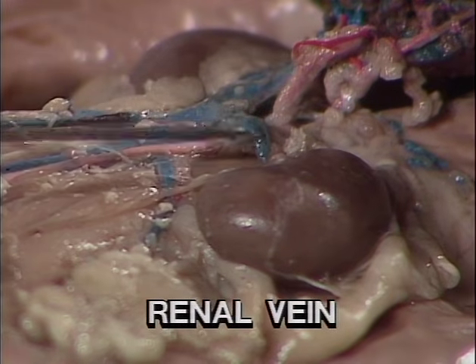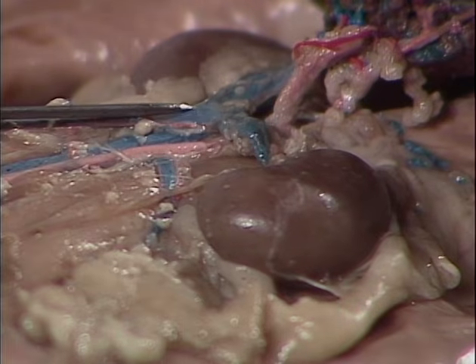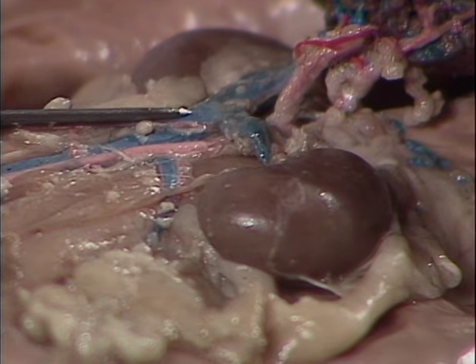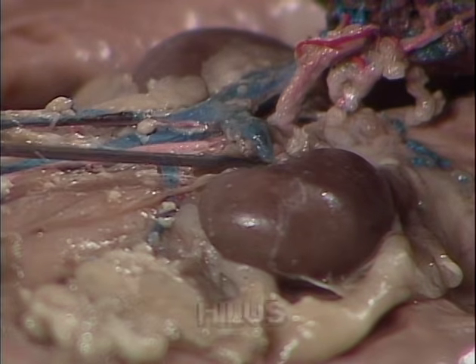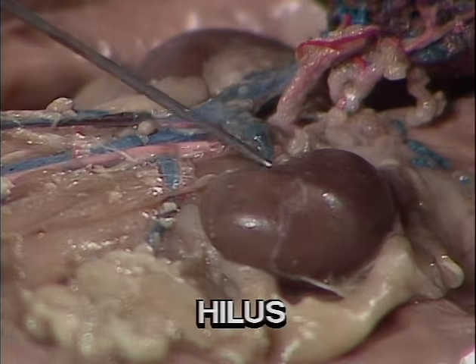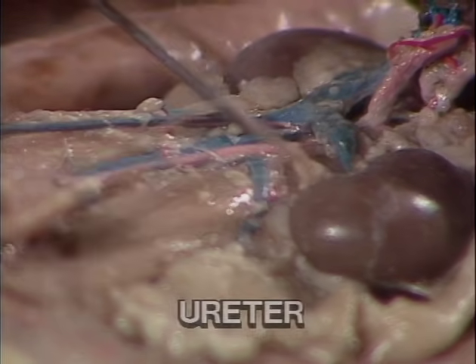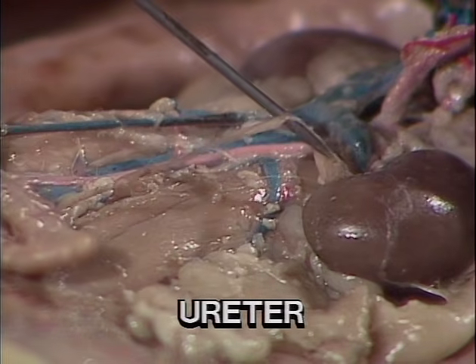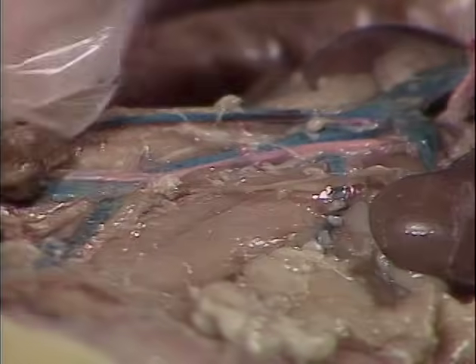It will leave the kidney and join the caudal vena cava. These two blood vessels are closely attached to one another. Both enter and leave the kidney through the hilus. Also leaving the hilus of the kidney is a white duct known as the ureter. It carries urine manufactured by the kidney to the bladder.